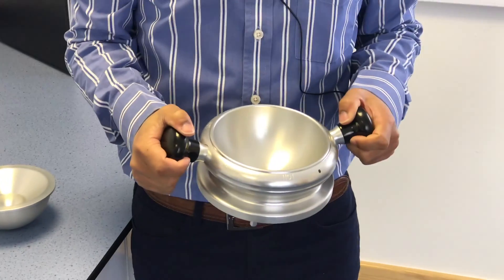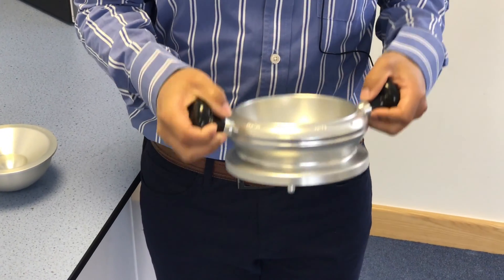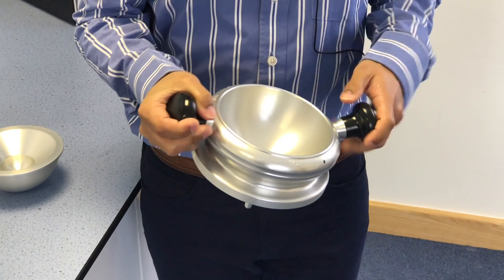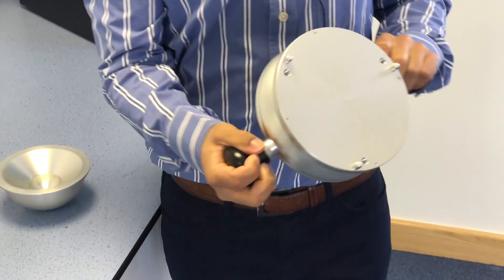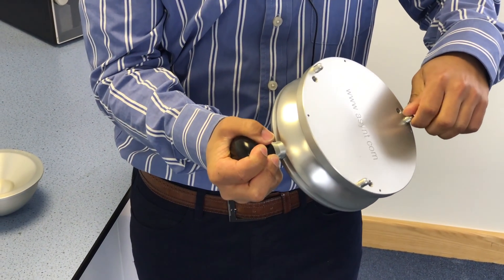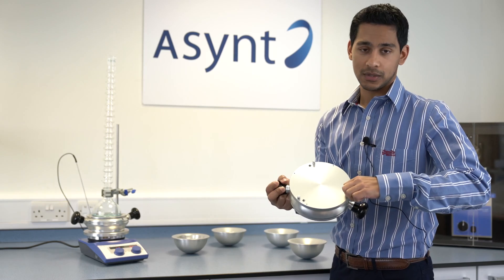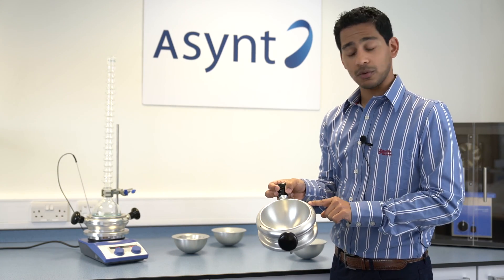The DrySyn Classic comes as a 1 litre base, all in anodised aluminium, precisely milled to fit ISO standard flasks. The heat-resistant handles are a big safety feature, and it is also flexible because it will fit on any standard hot plate stirrer due to the adjustable and removable feet. It also has a hole for an external temperature probe and a thermometer.